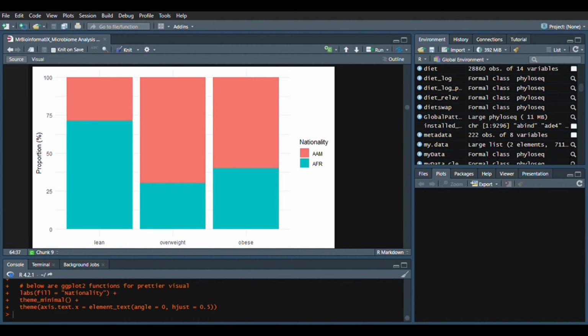But before proceeding with visualization, it's crucial to filter out only the prevalent taxa from the dataset. Prevalent taxa are identified as those that appear frequently across multiple samples. This filtering step ensures that only the most relevant and consistently observed microbes are included in the analysis. So, let's filter our prevalent taxa.